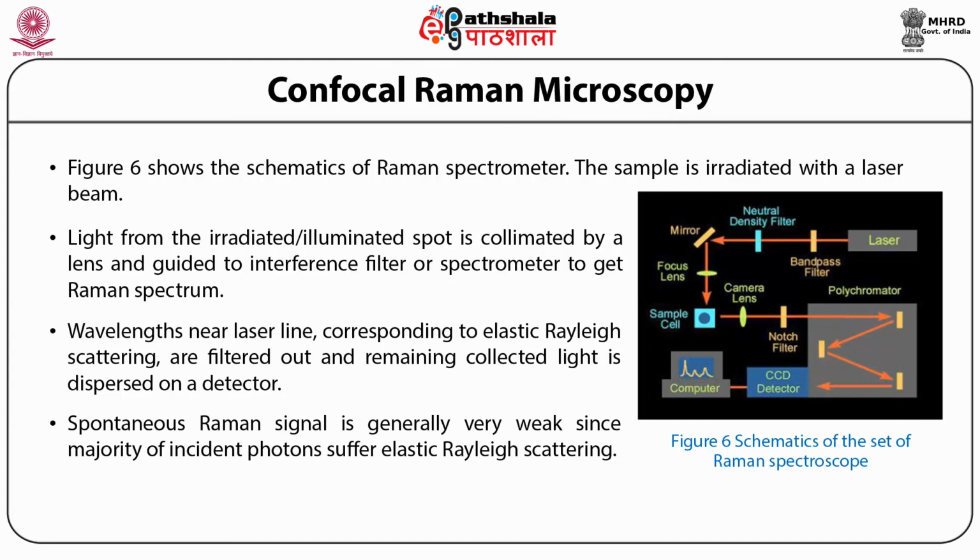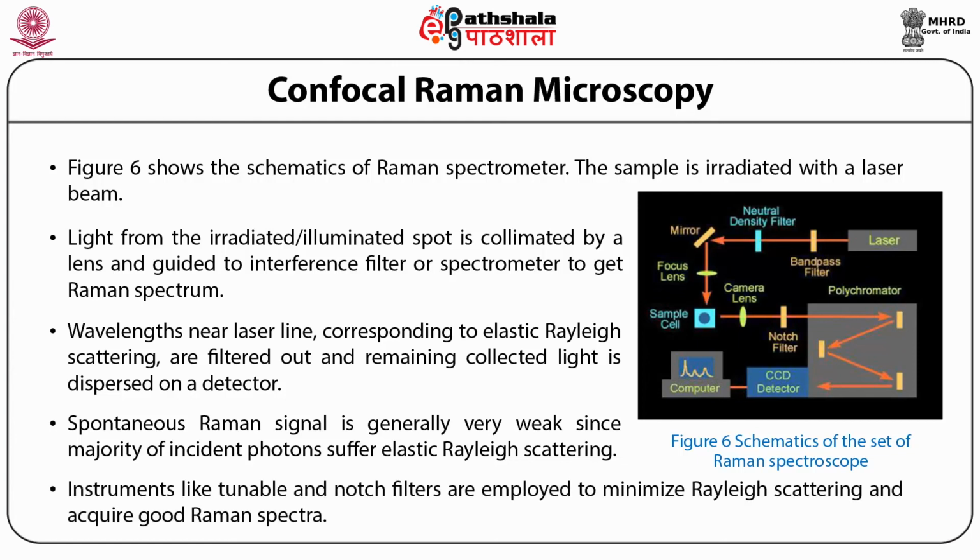Spontaneous Raman signal is generally very weak since the majority of incident photons suffer elastic Rayleigh scattering. Thus, special methods are undertaken to separate it from the dominant Rayleigh scattering. Instruments like tunable and notch filters are employed to minimize Rayleigh scattering and acquire good Raman spectra.